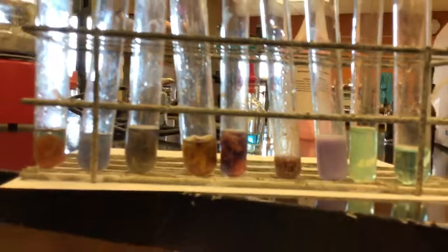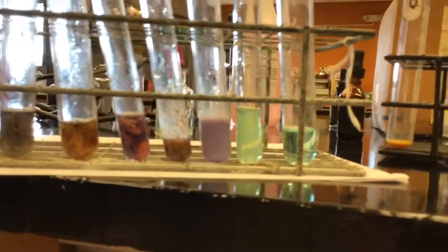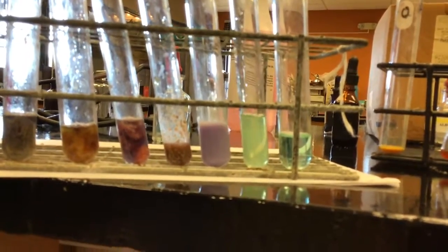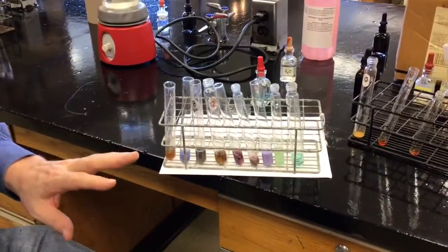I leave it up to you as to whether you think you're seeing a reaction. That is the walnuts. That is the milk. It's whole milk, incidentally. And that is the regular soda and the diet soda. It's interesting that those changed to different colors. Neither one of them's a purple, but they changed to different colors. So those are your results for your Biuret tests.